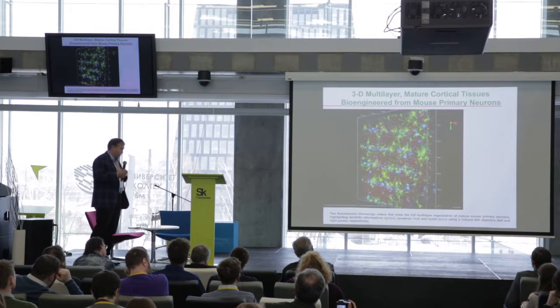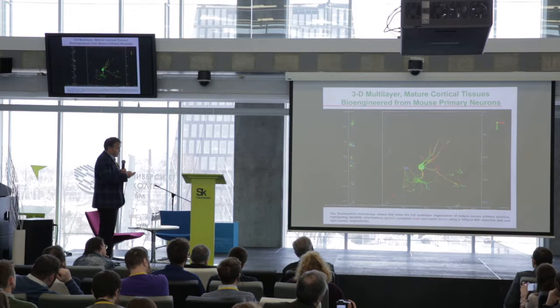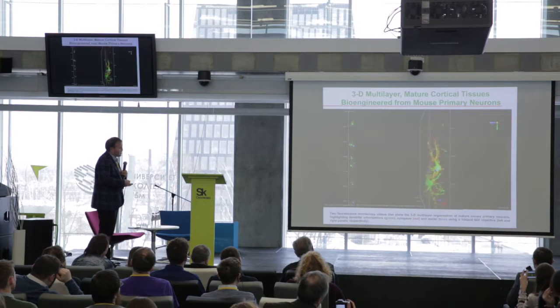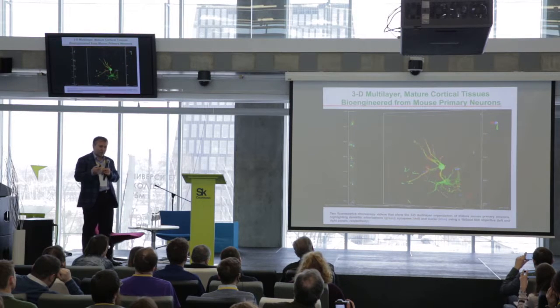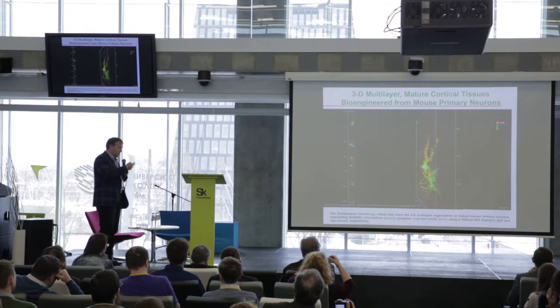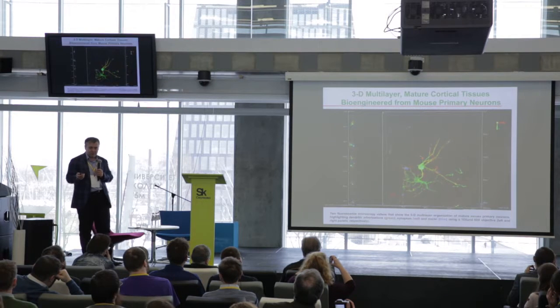So we are doing a lot of controlled experiments, taking a lot of zoom-in images to look for this synaptic activity, synapsin stains right on the neurites, and to understand if we have a system that is actually active, and hopefully at some point we'll be functionally able to prove that this is a neural circuit. Why is it important to show it's a neural circuit?